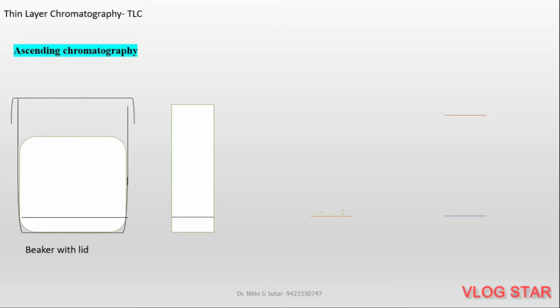After that, you have to apply the spot of the extract. You have to prepare the concentration 1:1, that is 1 milligram of your extract dissolved in 1 ml of methanol solution. Dissolve that, filter that, and then apply it by utilizing a dropper or a prepared capillary. The end of the capillary is heated and stretched in the opposite direction, so that a fine thread-like structure is obtained. Cut that, and by utilizing that you apply the spot.